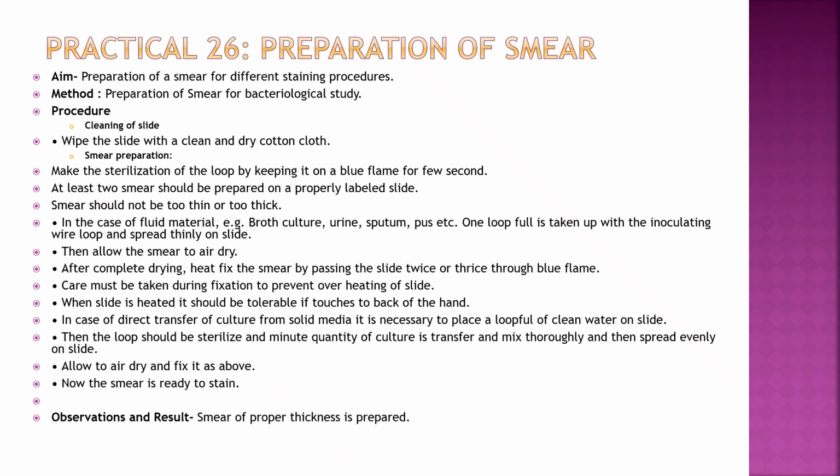Preparation of smear. So you have to take the clean slide and then the sample, then spread that sample over the slide with the help of a cotton swab or another slide, and then you have to dry that slide in the air and then fix that slide with the help of heat, and then the smear is ready for the staining.